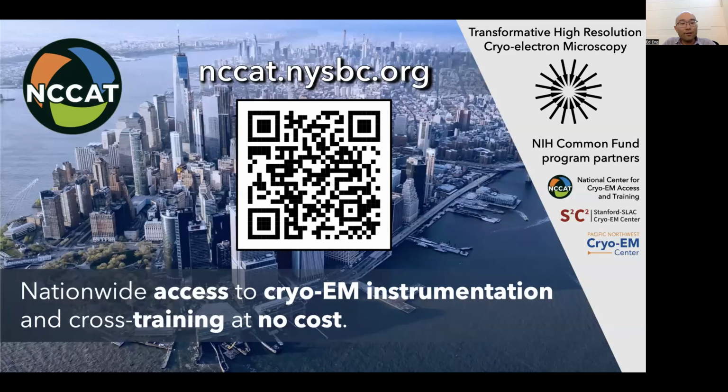Hi, my name is Ed, the manager of NCCAT here in New York City. We offer 3 main access types. One is high resolution data collection on our 4 dedicated Krios instruments. We offer a grid preparation and screening service, which you'll hear a little bit more about, for access to our plunge freezers, chameleon blot-free vitrification device, as well as a Glacios, and a robust cross-training program that has access to a Tundra that's going to get signed off this quarter, I hope.